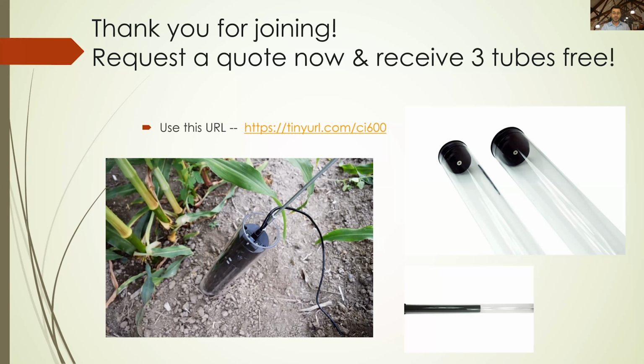All right, the next one is, how long does it take to get the total root length of a typical single depth 360-degree scan? Actually, it really depends on how complicated the root structure is, to be honest. If you have a fairly simple root structure, I've seen it done within 20 minutes or less. If you have extremely dense, very complicated roots, and you're mapping out each single one, that is always going to be a longer affair.